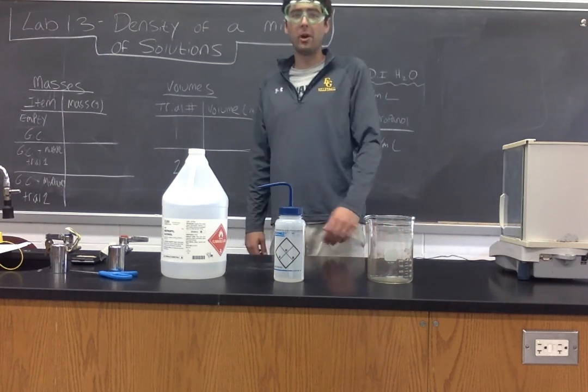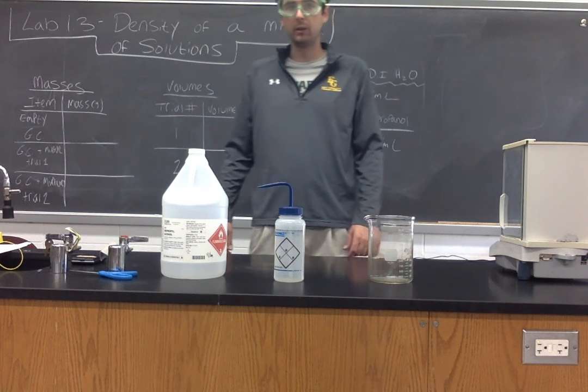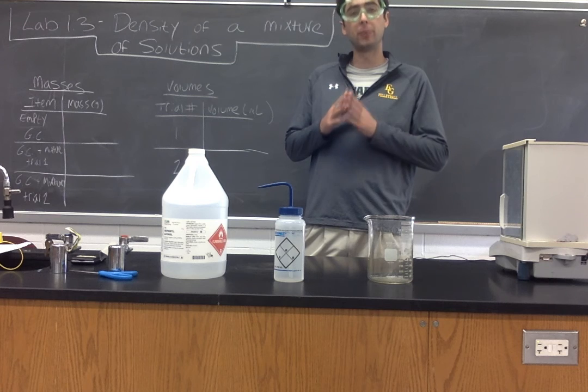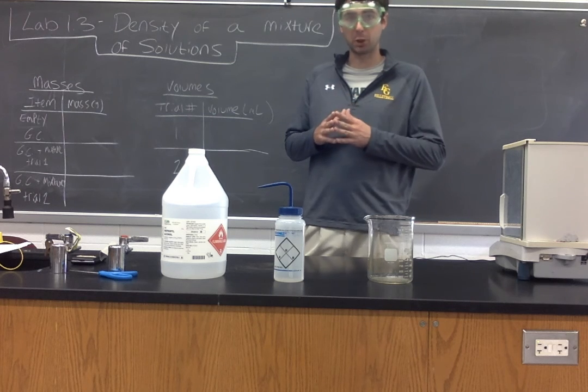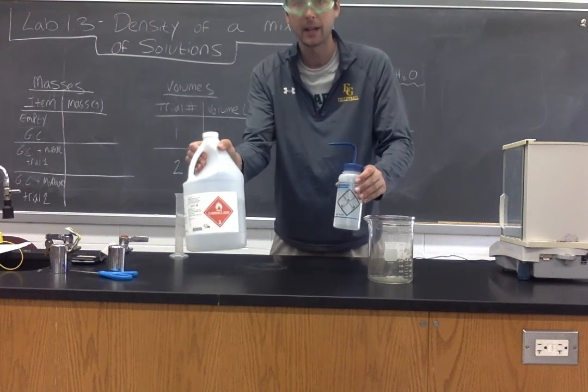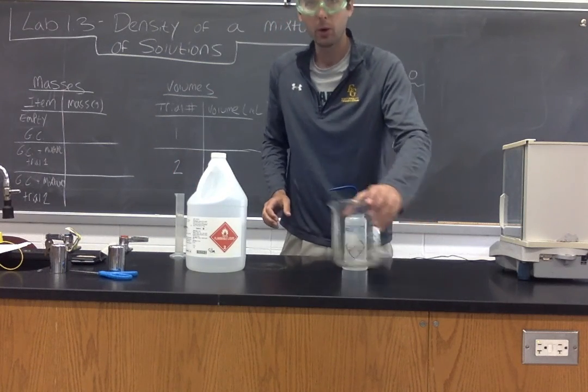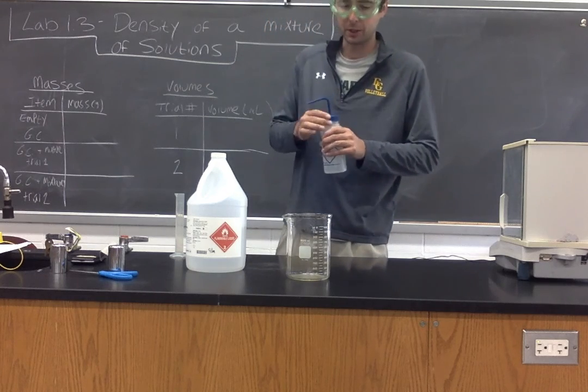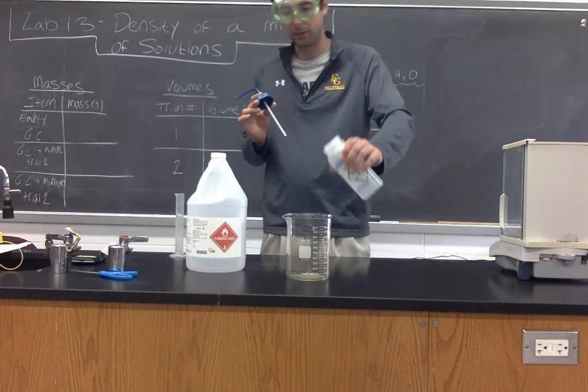Hi everyone, this is Lab 1.3. We will be using the property of density to find out the percentage breakdown of a mixture. What I have here on the front desk is deionized water and isopropyl alcohol. I am going to make a mixture of these two solutions by just pouring them into this large beaker.